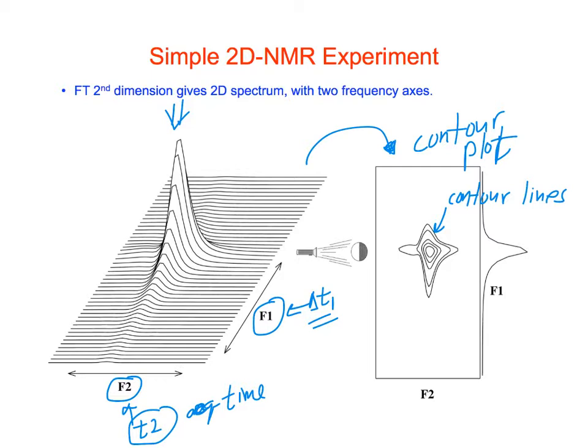Yeah. 1D, not this way? Now, if you do it like this, that's kind of a measure of like threshold or something. I meant like coming out of the board. This way? Yep. Well, that would be the same thing. We've got two dimensions like this, right? So essentially the cut like you're talking, well, actually if we cut it this way, what we see, this is a little flashlight shining on this side, what we would see would be essentially a shadow that looks like this peak over here.